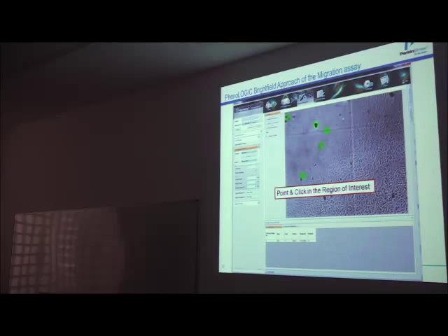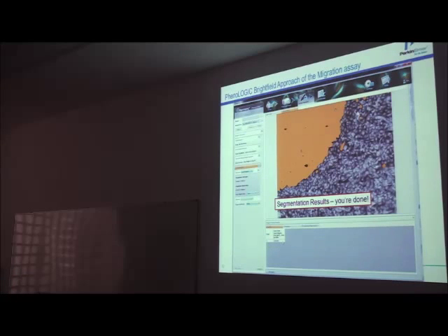And you go in training mode, class A in green, and you just click on the image, right? On the class you want to find. But because on this training ring here, the texture is different in this area. It's a different texture. Right. If you say next, then it will tell you what is the part of the image with the similar texture. What you have just said.